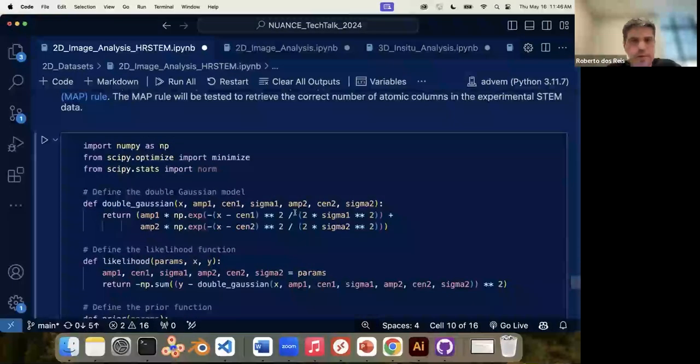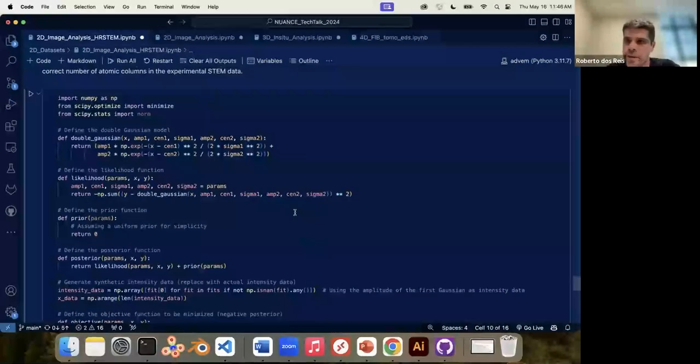Let me just zoom out. How am I doing on time? Okay, maybe I just finish this.